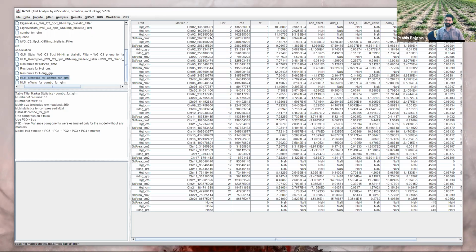One common program you've probably heard of is HaploView. You can import your genotypic data, and depending on some parameters you enter, it'll calculate the haplotype blocks in that chromosome, and it'll give you a list of where these SNPs fall. And based on that, I typically declare, okay, these two are most likely to be the same QTL because they're in the same haplotype block.